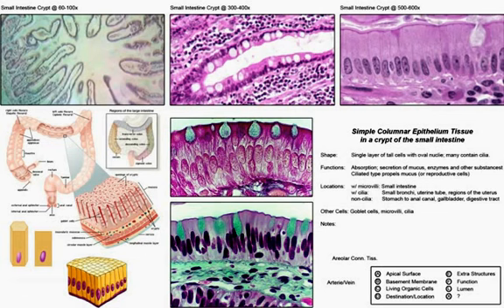Okay, so these cells that we're looking at, to reiterate, are columnar. Their primary function is absorption, and the line of microvilli, or the brush border on their apical surface, enhances thousands of times the ability of these cells to absorb the nutrients from the food we've eaten.